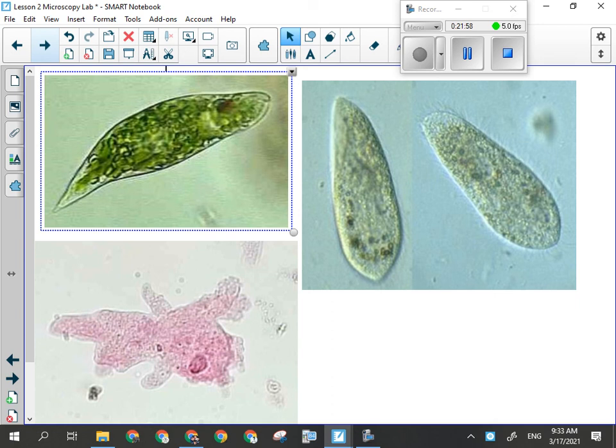No questions? Yep. All right, everybody with me there? You good with that? Okay, so those are the four things: the letter E, the amoeba, the paramecium, and the Euglena that we'll be looking at under the microscope tomorrow.